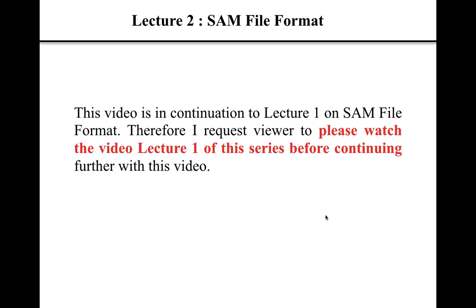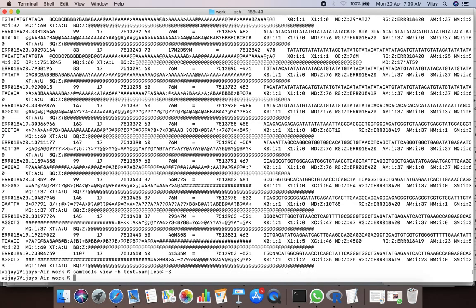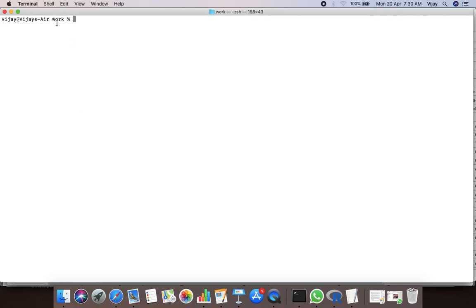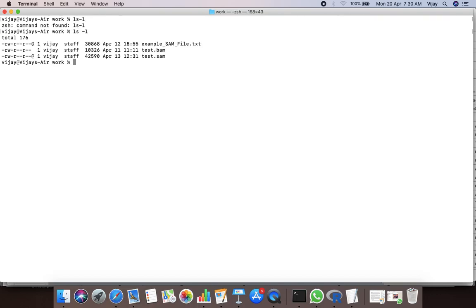Now let us display and examine the content of the test.sam file that we created in the last video. I already have downloaded the file and stored it into a folder called 'work'. To visualize the content of the folder you can use the ls command, and here is our example SAM file.